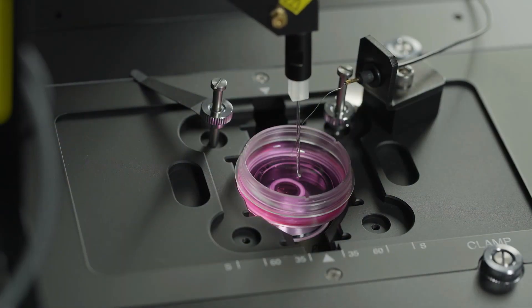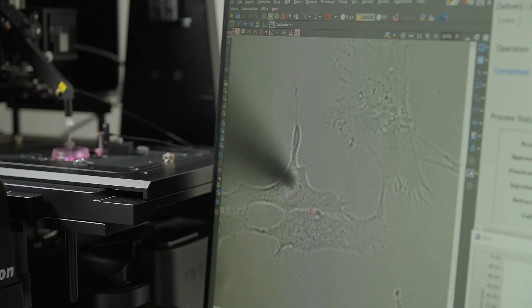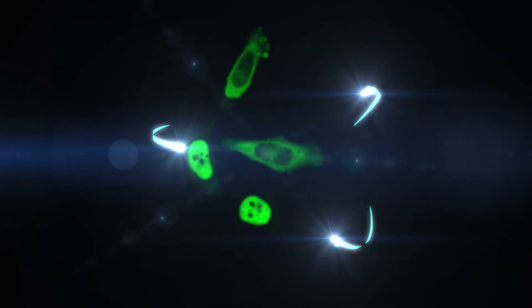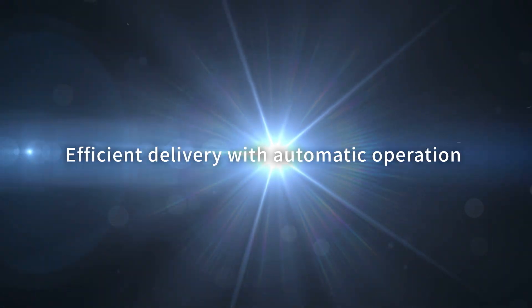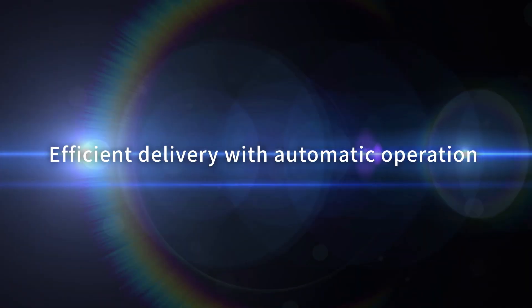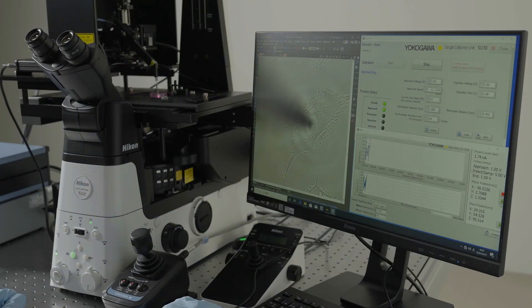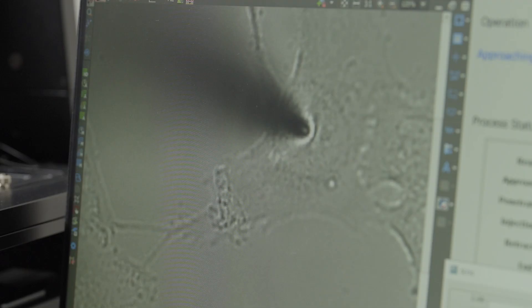Substances can be delivered directly to the cytoplasm or nucleus while observing the cells. Automatic payload delivery to target cells is all software controlled.